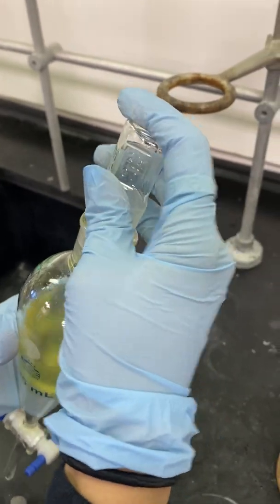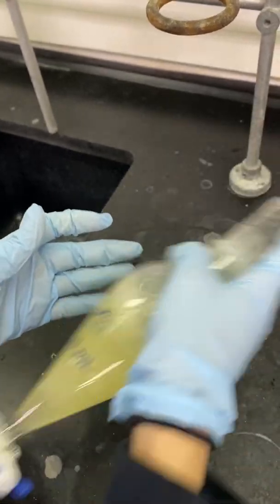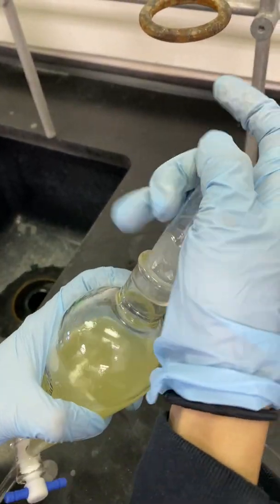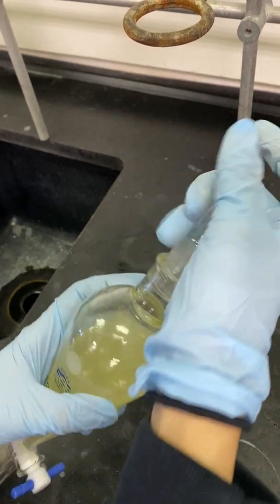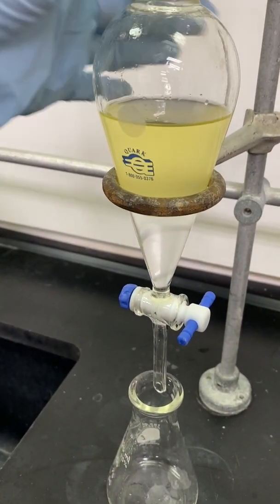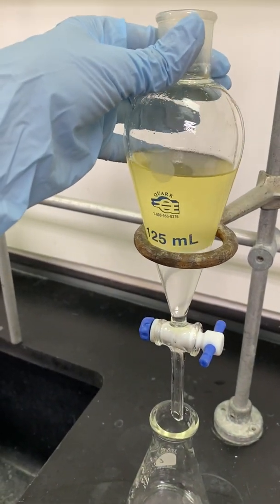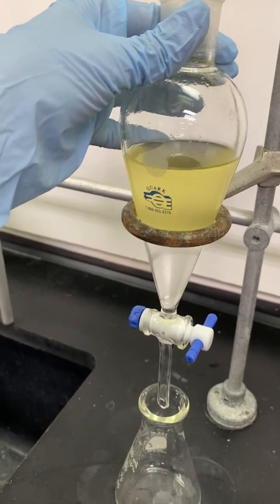Once I have dissolved all of my product in ethyl acetate and transferred it to the separatory funnel, I will now begin to shake and vent the separatory funnel for a total of three times before draining the aqueous layer into a 125 milliliter Erlenmeyer flask.